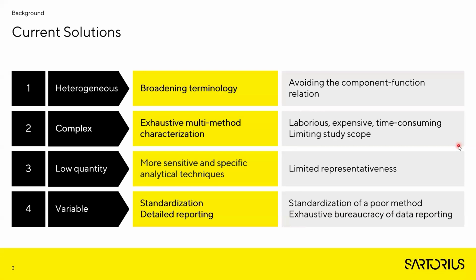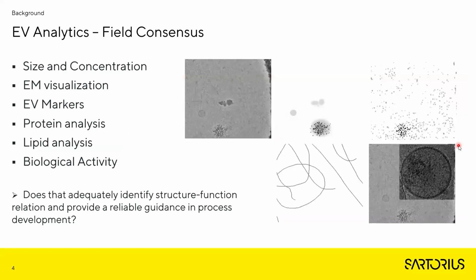If we have poor methods, the results will remain poor no matter how detailed we standardize the procedure. So basically, the current methods, the established protocols, usually give us a very tight insight into the samples.